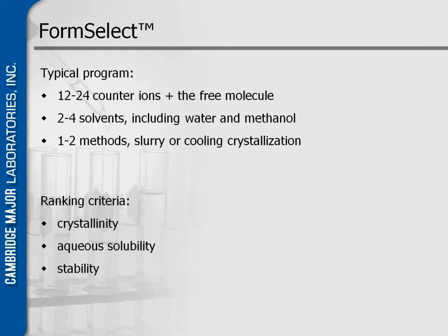All of the ranking criteria need to be looked at before you start the program, because if you have a problem with your solubility, the choice of your counterions will be such that in general these counterions will improve the solubility. And when you know it doesn't want to crystallize, you go to larger counterions or find a way to influence your nucleation behavior and to crystallize it in a better way.